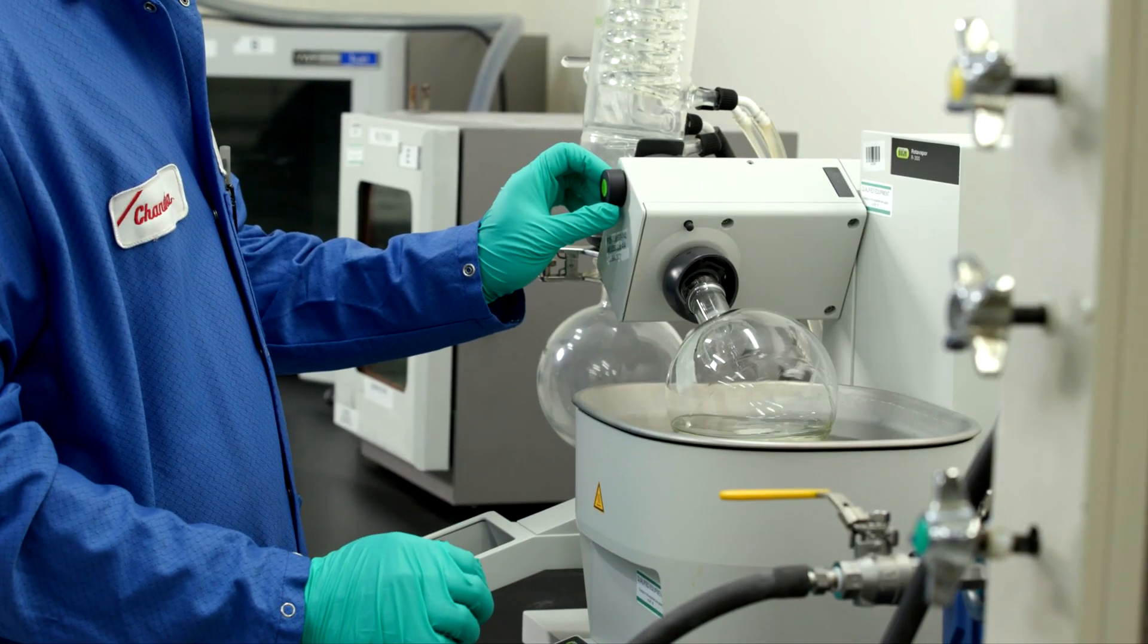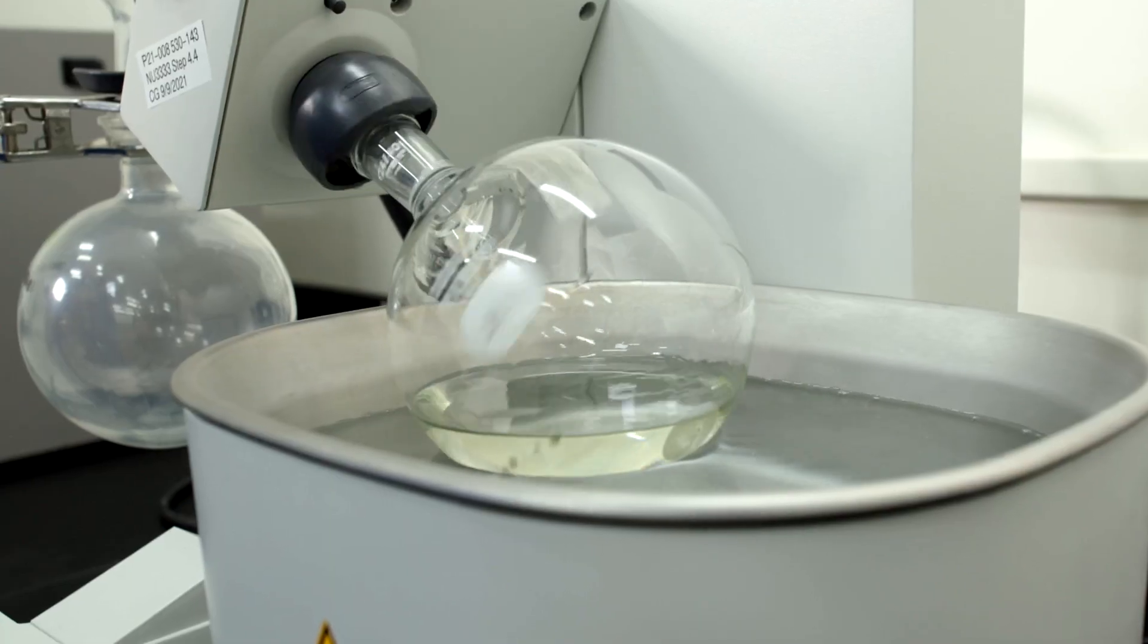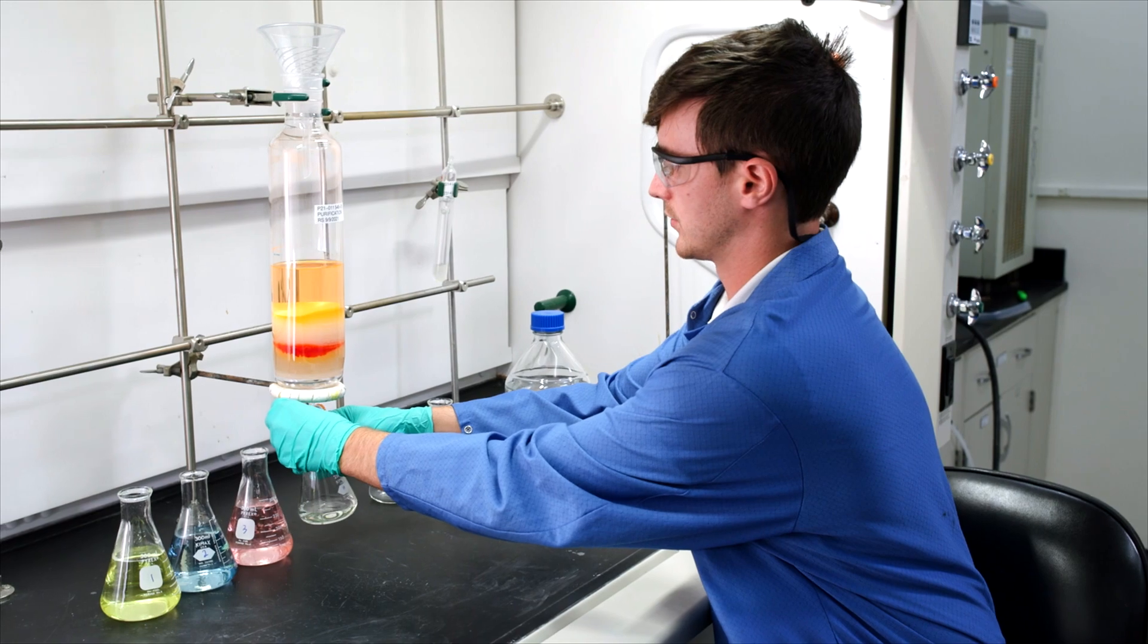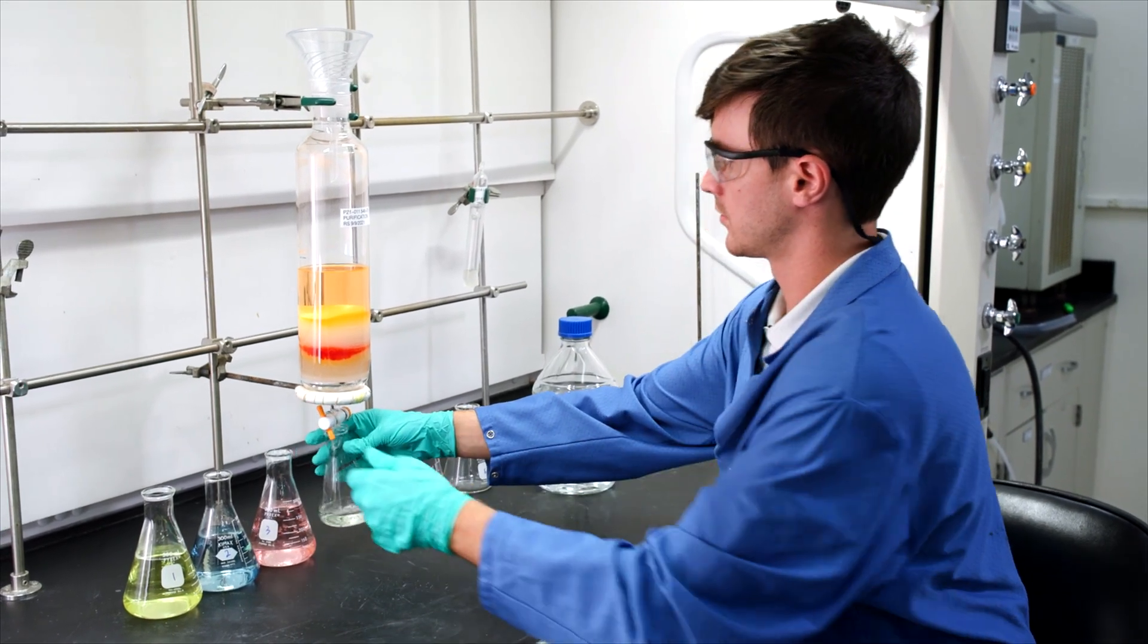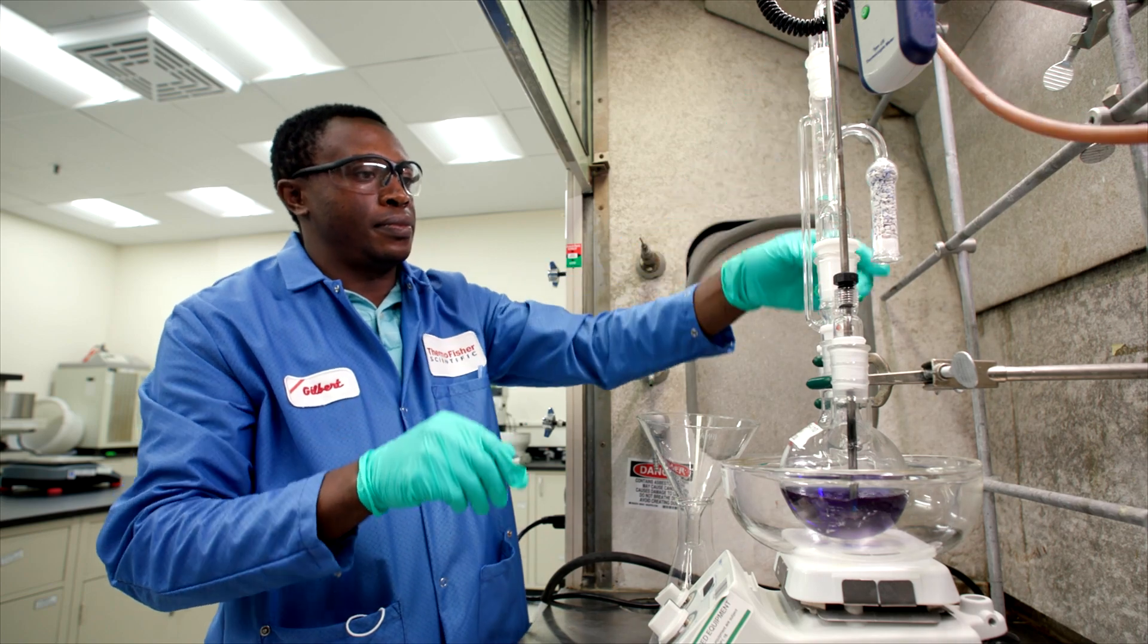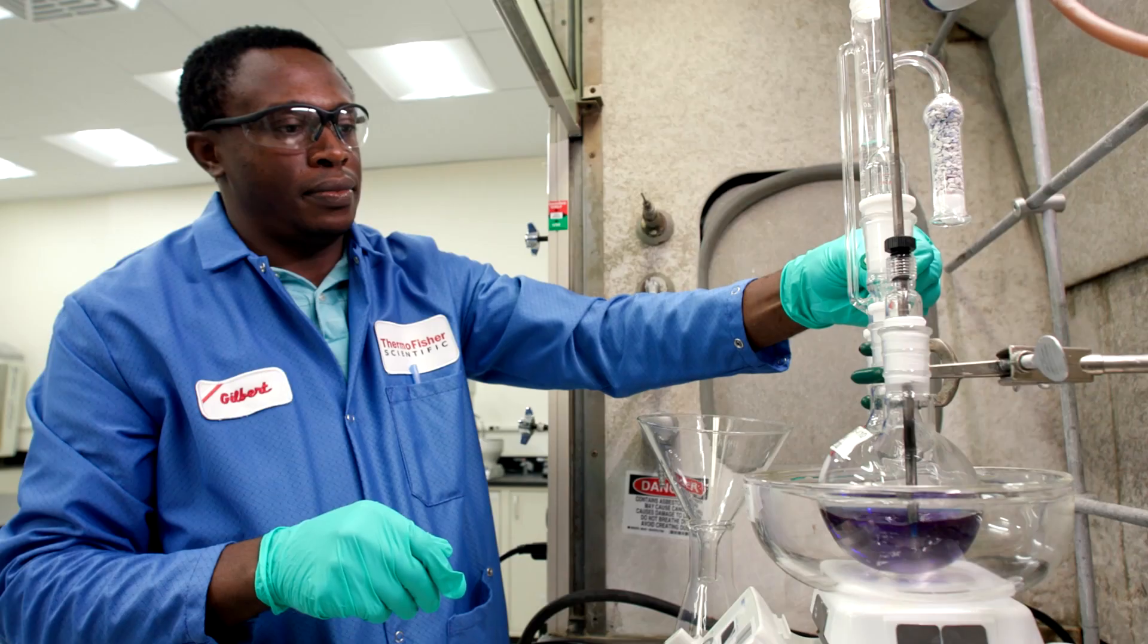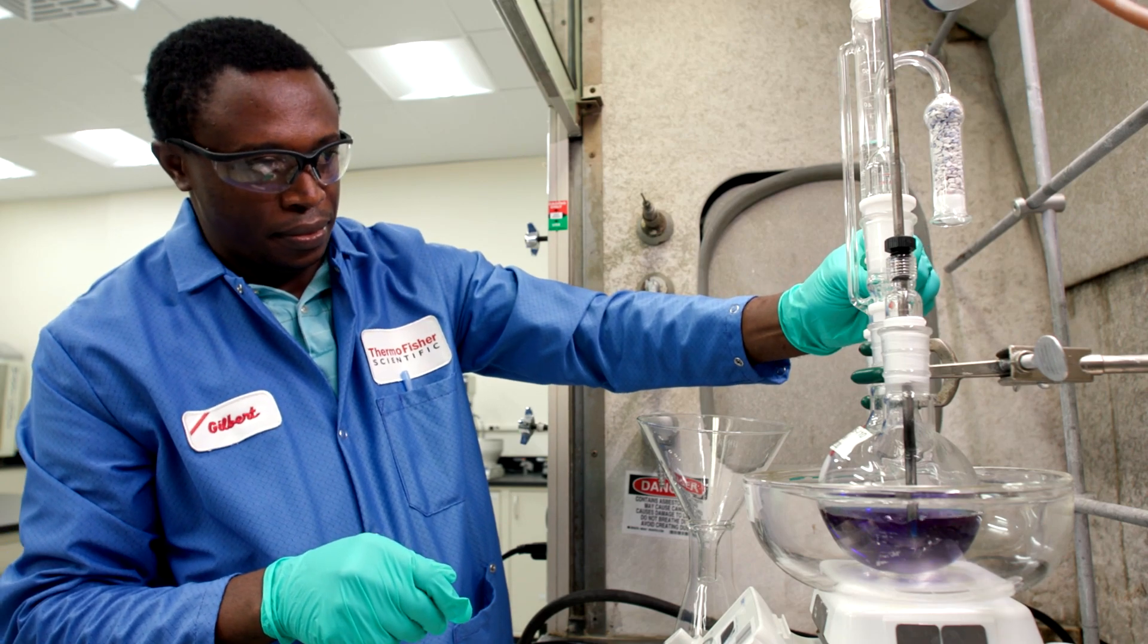For custom services, our process development and project management teams have years of scale-up experience to help you streamline development through clinical trials and into commercialization. From small to industrial scales, we align with you on expectations and your technical needs every step of the way.